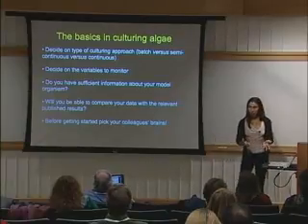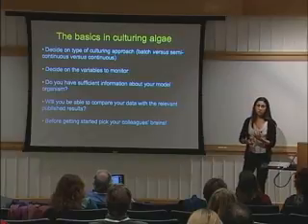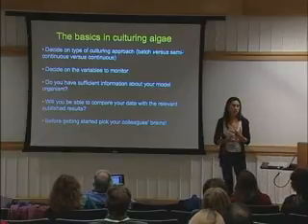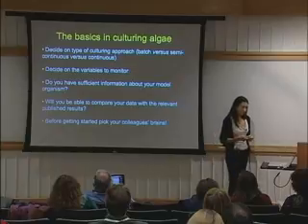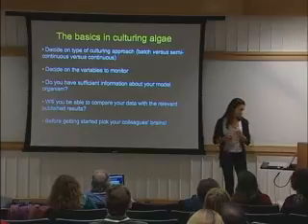You have to decide on the type of cultures that you are going to use. So you can use batch cultures, which I will show you in a second. You can use semi-continuous culturing approaches, or chemostats, or continuous cultures. So depending on your question, you might want to choose one or another. Of course, for these long-term evolution experiments, you definitely need continuous cultures.